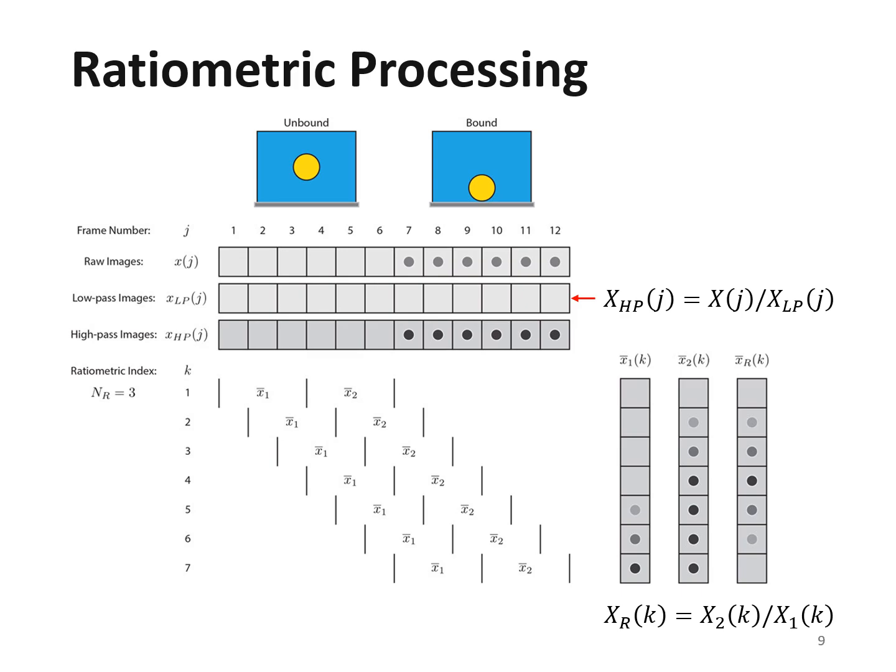In the XR image, we can see that the particle signal is strongest at frame 4, showing that the particle touched the glass surface at that time. The advantage of this method is that even if the particle doesn't stay on the surface but moves up and down, we can still see a dark signal, each showing the particle touching the surface n times.